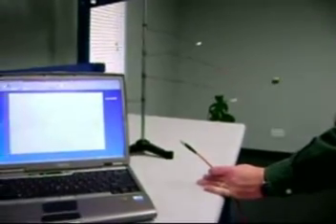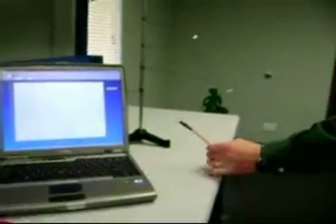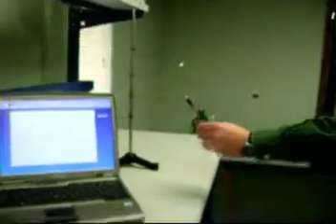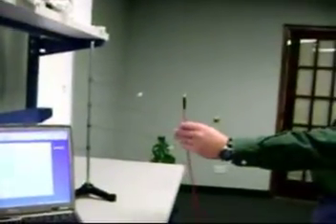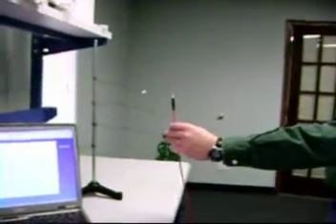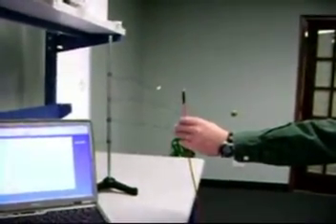The first technique we'll be looking at is overhead lighting. In order to do this we simply direct the fiber optic cable towards the overhead fluorescent lighting, and you can clearly see the emission lines from mercury in the Avisoft software interface.